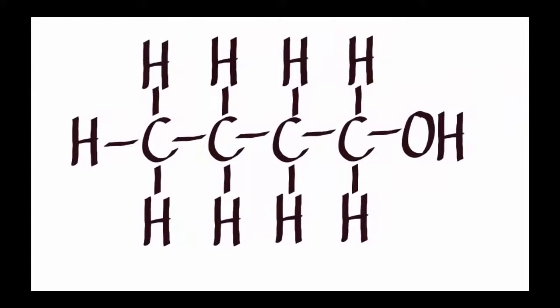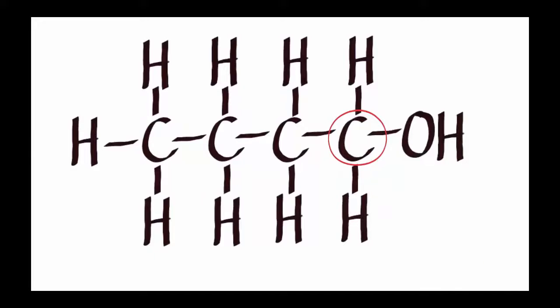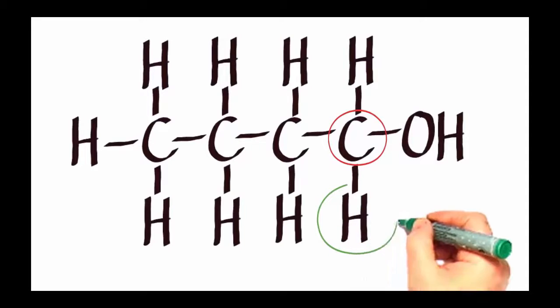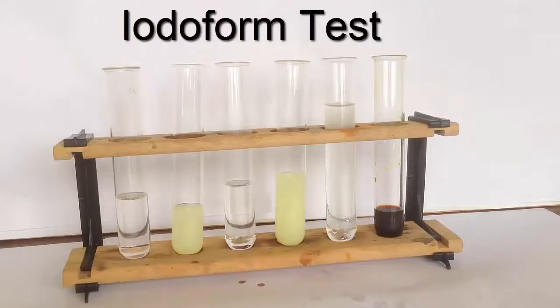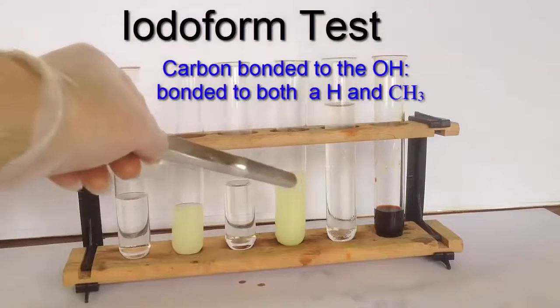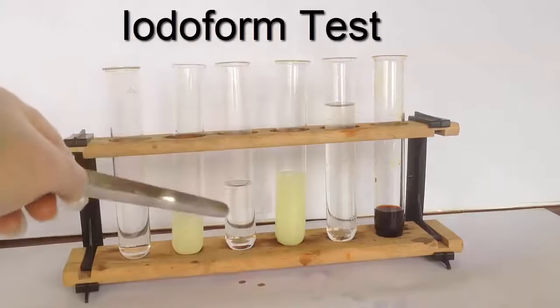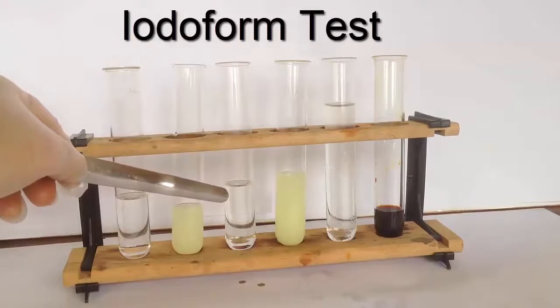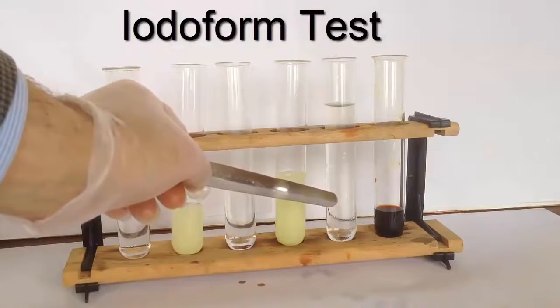Here's the structure of butane 1-ol. There's the carbon that's attached to the OH. You can see that it does have a H attached, but it doesn't have a methyl group. It has a propyl group instead, and that won't do. So that's why it was negative, exactly what one would have expected. So that's the ethanol. We had a positive test with that, and we had a positive test with the propane 2-ol there. We had a negative test with the propane 1-ol, and we had a negative test with the butane 1-ol.